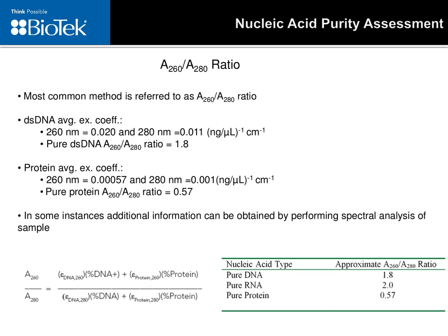Spectra covering this range will ensure capture of the absorption profiles of biomolecules as well as those of any potential contaminants, should they possess a chromophore of significant absorptivity over the wavelength range covered. Therefore, spectral analysis can provide a relatively quick method of detecting the presence of contaminants without destruction of the sample.